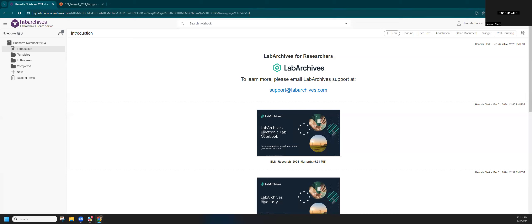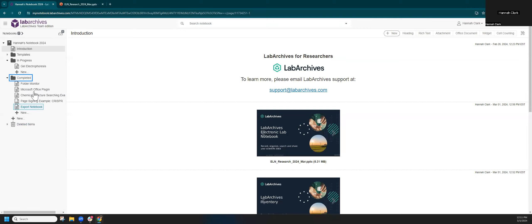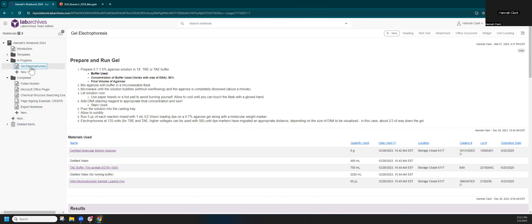When you first log into Lab Archives you'll come to a page like this. I've already set up a notebook with some content. On the left-hand side, my notebook is called 'Hannah's Notebook 2024,' with all of my data and projects for 2024. Within a notebook I have various folders — you can create as many as you like, with subfolders for a complex structure. I have a folder for templates, one for things in progress, and one for completed projects.